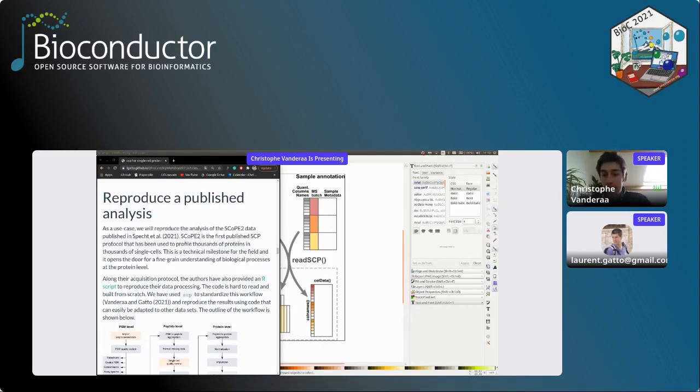I personally haven't tried this yet, but what I would do is, if you expect your proteins to have divergence, include in this UniProt database several new protein entries that are adapted from the original one. That's how I would do it, at least.